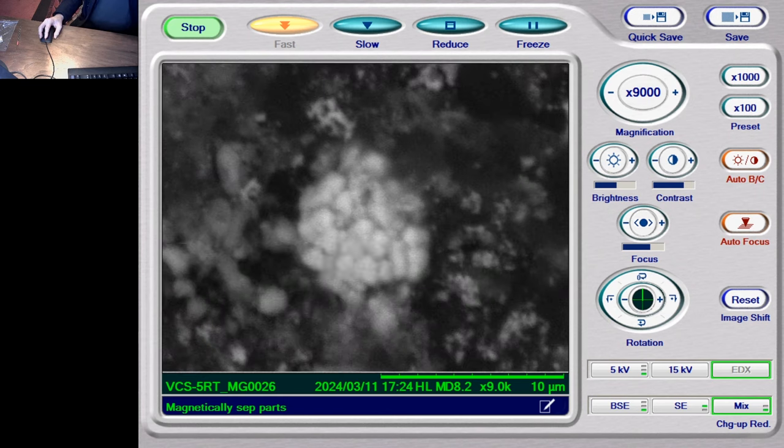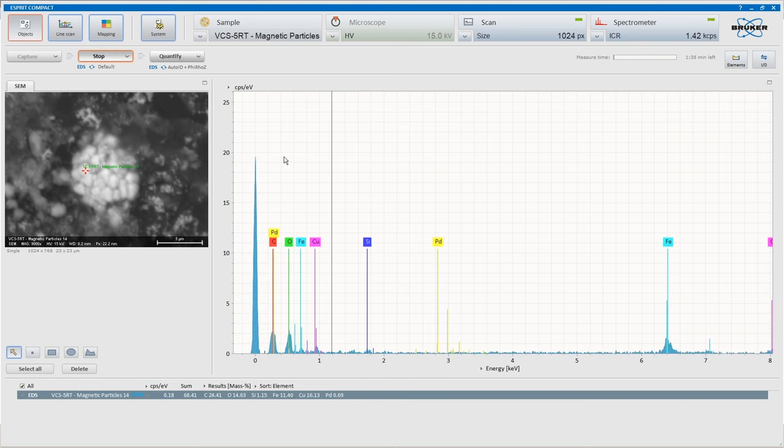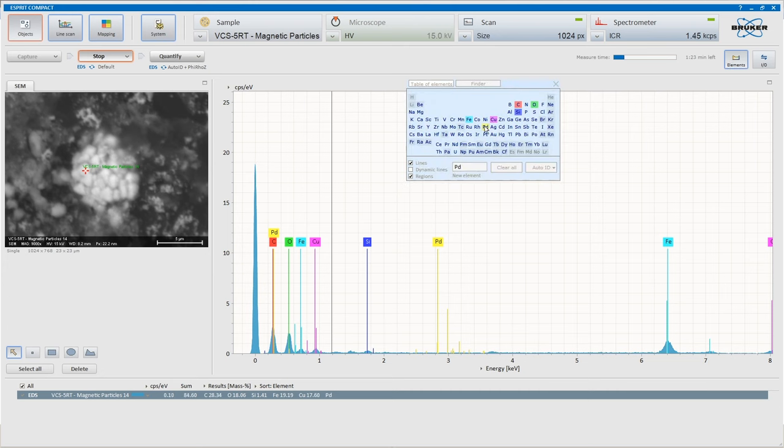Let's see what that is. Interesting morphology. What is it? I don't think that's palladium. No, it's not palladium. It's not getting a lot of counts. The beam is not seeing it. Why is it not seeing it? Not palladium. Can't be palladium.